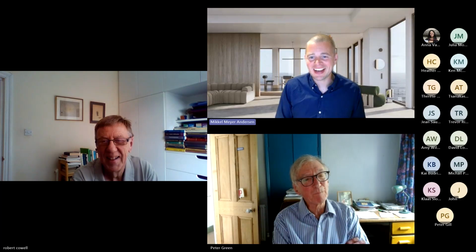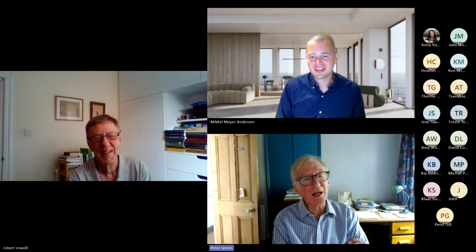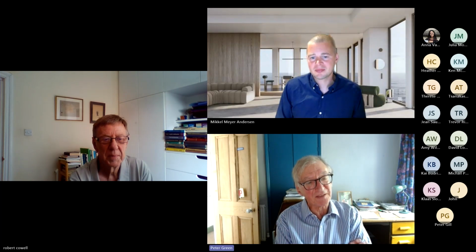But okay, I would like to close on this disagreement, if that's okay, Peter, or unless you have a brief comment. No, I just want a brief comment on the previous part of the discussion about number of contributors and so on. I think we shouldn't forget this is still at the end statistics. We're talking about parametric statistical models, and we shouldn't forget about all our understanding about lack of identifiability and near identifiability. And we shouldn't expect in noisy data to be able to discriminate very finely different models. And it just becomes particularly difficult with very small contribution probabilities, of course.